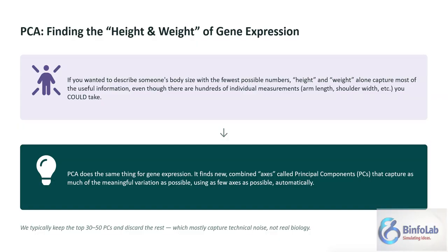Taking this example of human body size, in a similar way the PCA also takes care of the gene expression in combined axes.